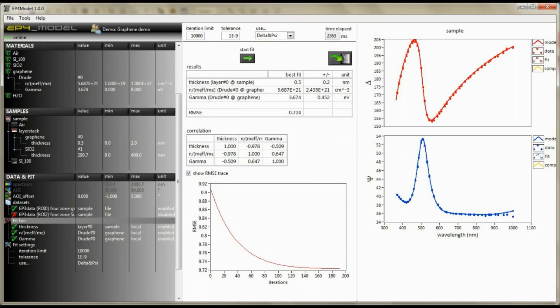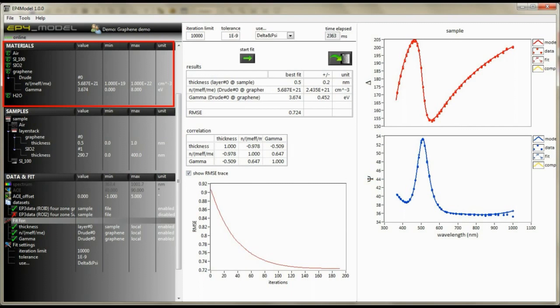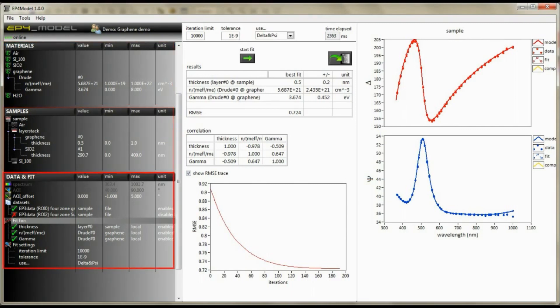There are three parameter definition sections: the material definition section to define all materials present in your sample, the sample definition section to arrange those materials in the right order, and the parameter definition section for fit and simulation.